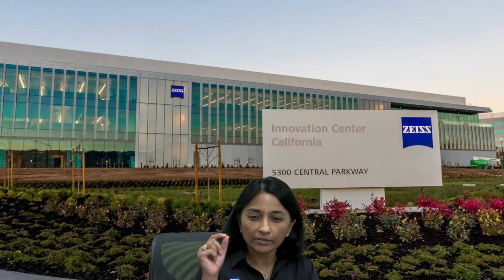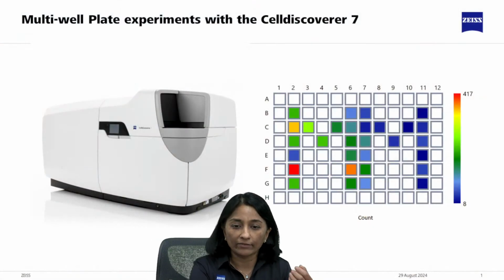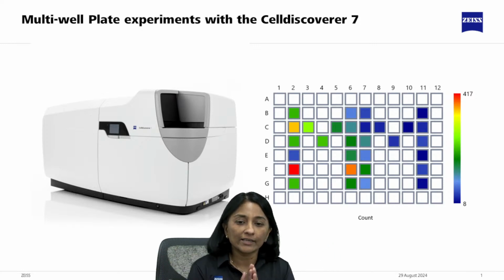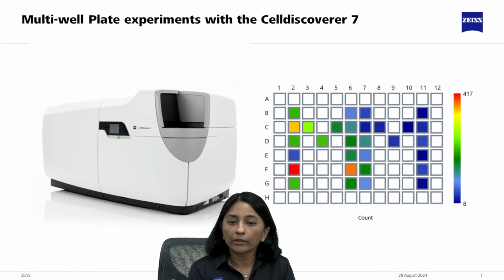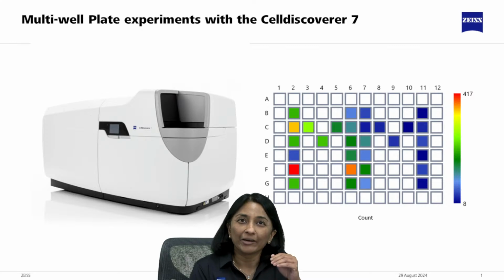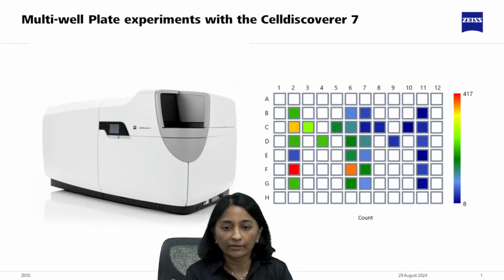Even though it's 13, it's a very lucky episode because you will get to see multi-well workflows and experiments on the Celldiscoverer 7. So the CD7, as we call it at ZEISS, is one of my favorites. Really, it's an instrument that can do everything. It's an automated instrument, and without me having to bore you with a lot of slides and specs, let's just go right in front of the instrument at the lab. Just give me a second. I'm going to walk over, and then we'll do things live at the instrument.